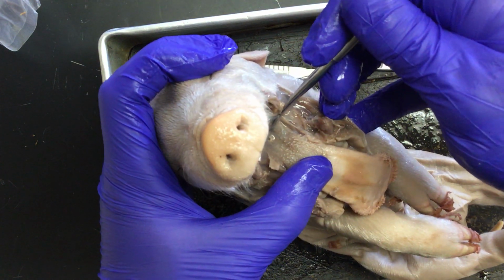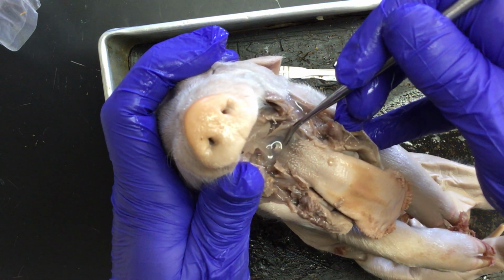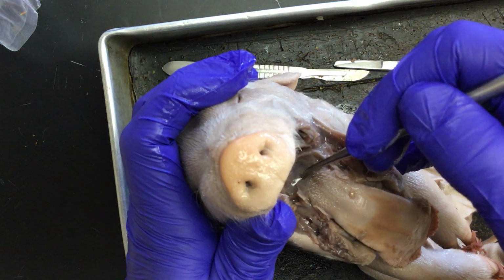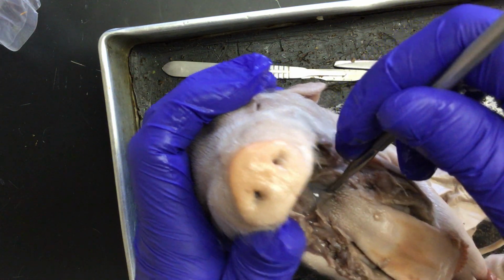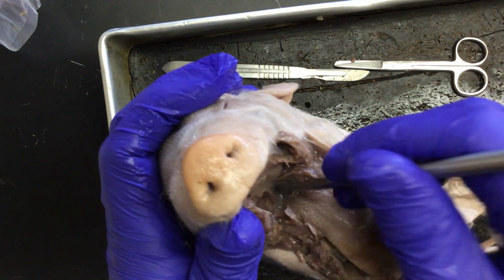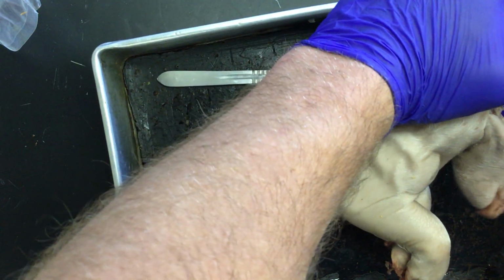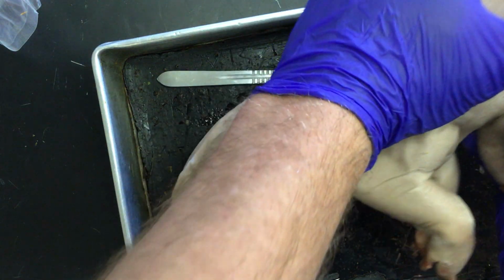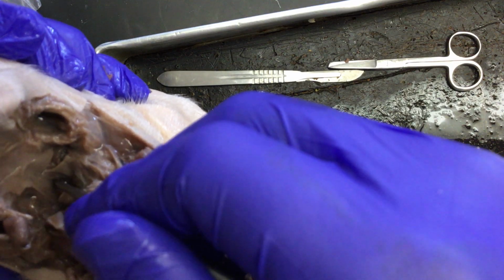This is the pig's trachea. This little tube we see right here. This will feed into the pig's lungs. As I'm moving down now, I can move into the pig's lungs if I continue on this trajectory. And this hole further back. Let me just drain it just a little bit more. Great.